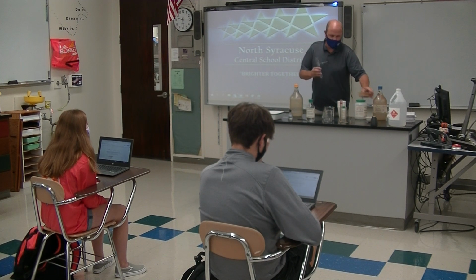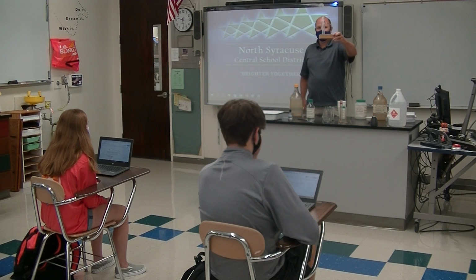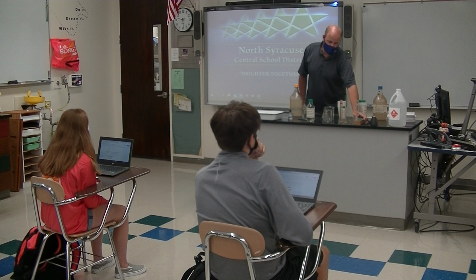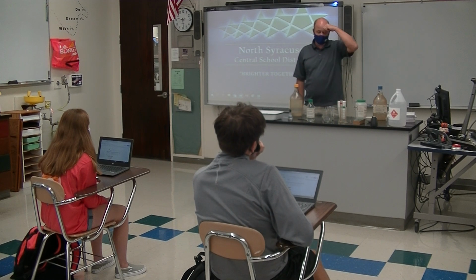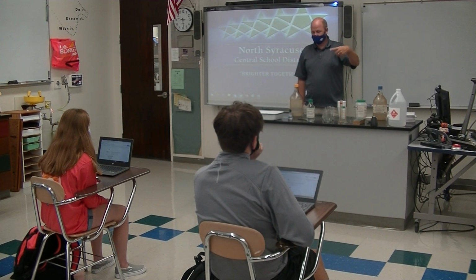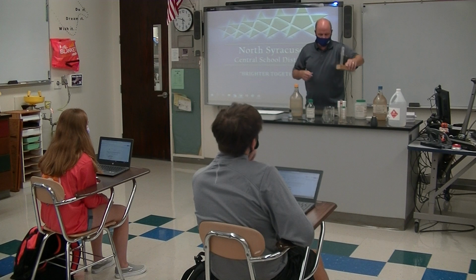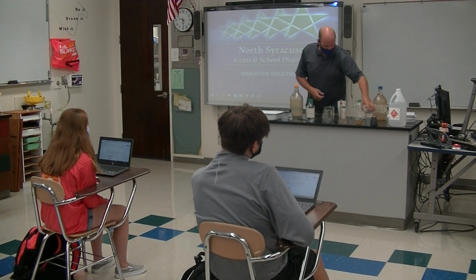What do you think this is? These are all things you're going to have to know. So in the homework, in the presentation on the slideshow, it's there. This right here is a version of a test tube rack. It holds multiple test tubes. Let's see, what else have we shown you?